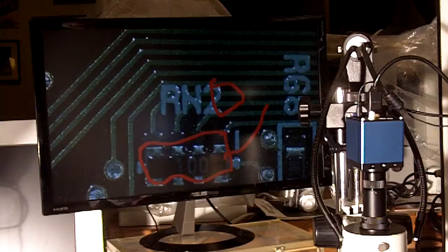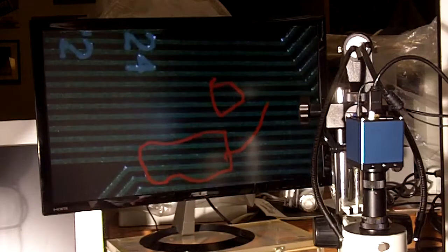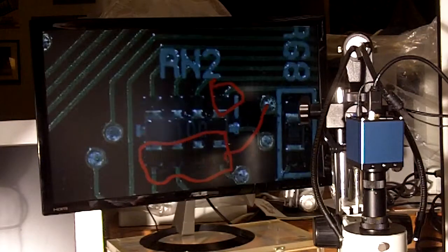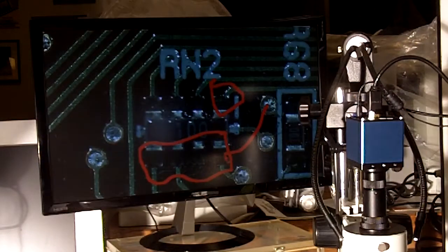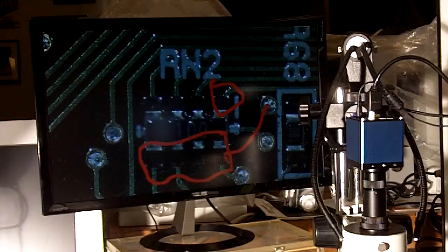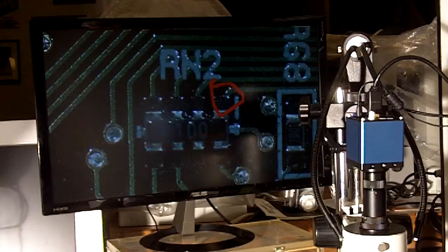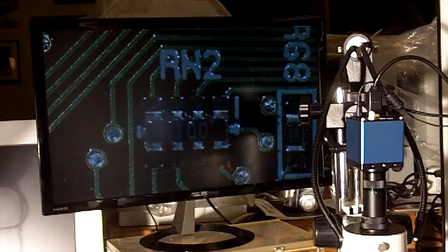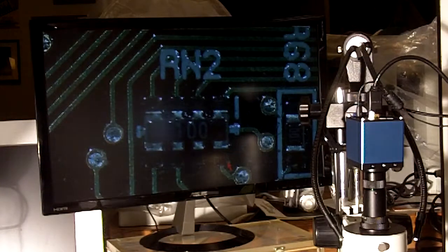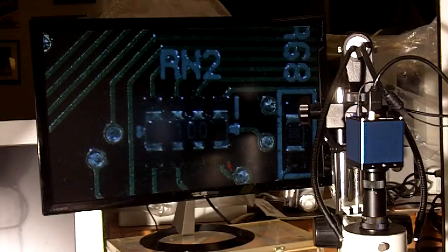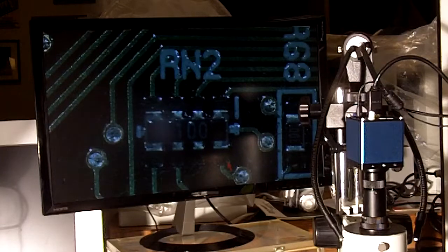This is not a digital image. There's no computer involved. We can quickly delete those marks by using the right hand mouse button.